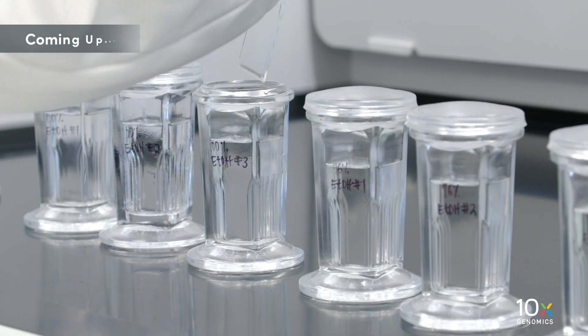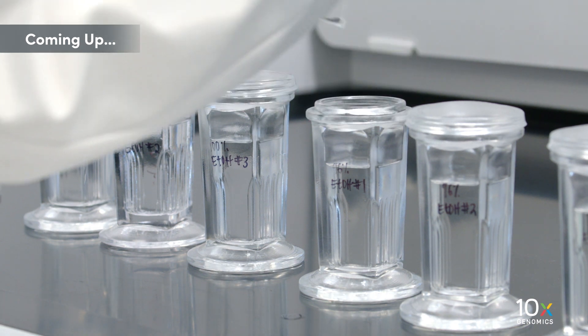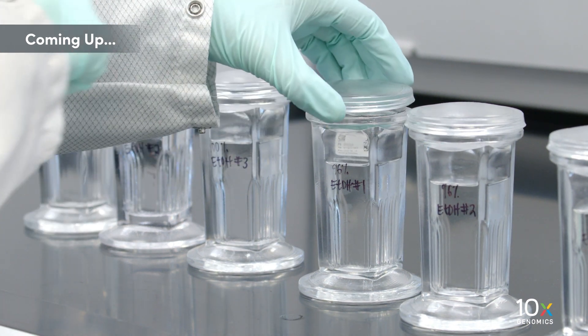The Visium Spatial Gene Expression for FFPE kits are ready. Next, we will deparaffinize the tissue.